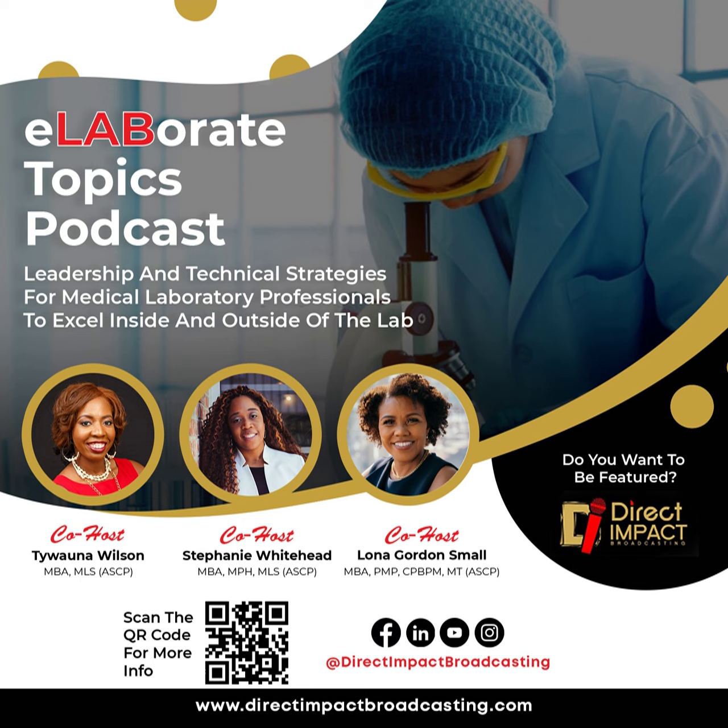Maybe it's emerging technology that's out there, and so it's time for you to look at equipment because there's something new. Over the past couple of years, as you all know, we have been dealing with COVID. And so vendors have come out with their platform, emerging technology, and every lab wanted to be on the forefront of testing. That was a reason for new equipment, because the environment drove the need for that technology. So sometimes it's the age of the equipment, sometimes it's emerging technology, sometimes it is your community, your population. Maybe you need to think about another platform because your current platform is not meeting the needs of your particular population. You also need to think about throughput and turnaround and expansion opportunities. So those are reasons for why you may need other equipment.